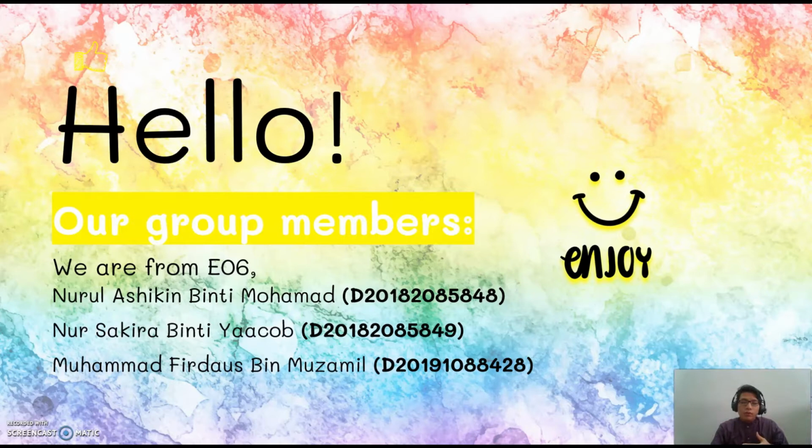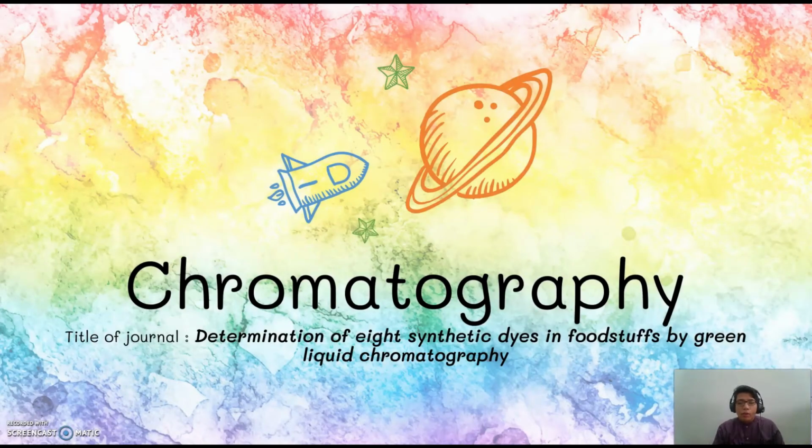For our group E06, we'll be discussing the topic of chromatography. Our main journal is titled Determination of 8 Synthetic Dyes in Foodstuff by Green Liquid Chromatography.